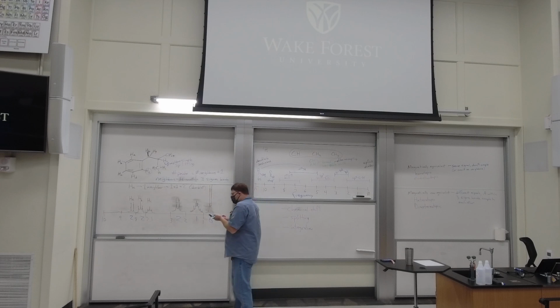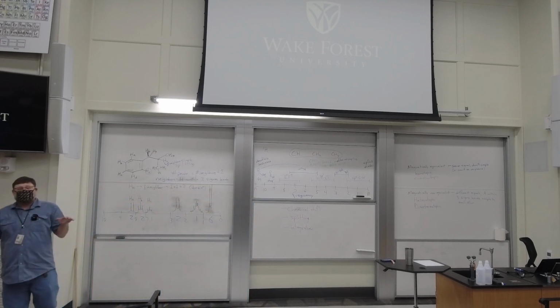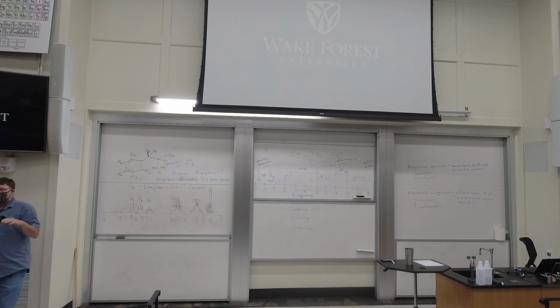All right, your proton NMR is going to give you by far more information than any of the other spectra that you see. In the lab, if we have a decent idea of what the product should be, when we get a product, we run a quick proton NMR. If it looks like what we think it's going to be, we don't really bother with the other spectroscopies.